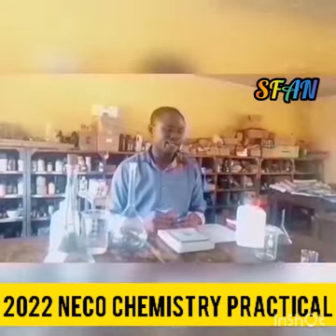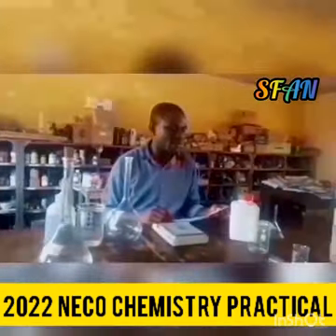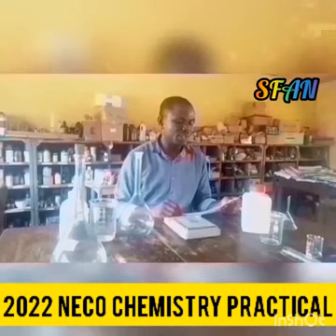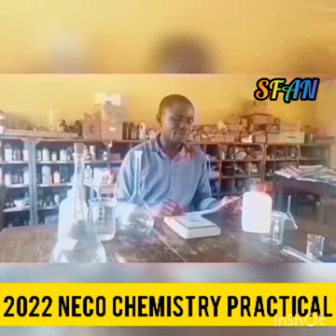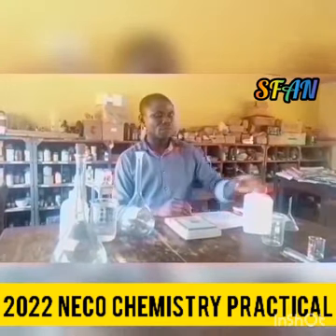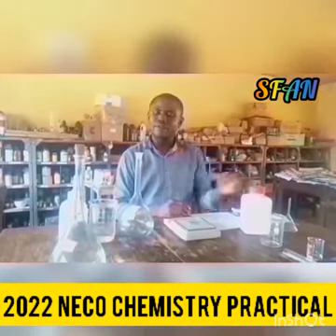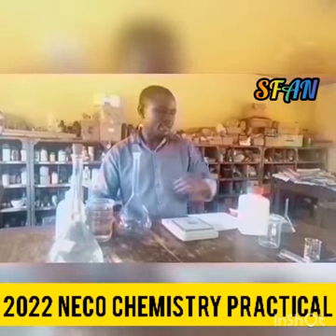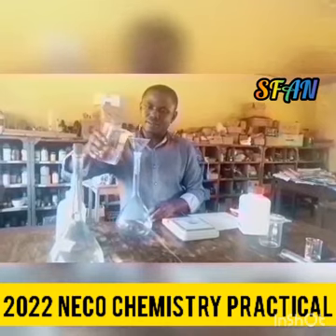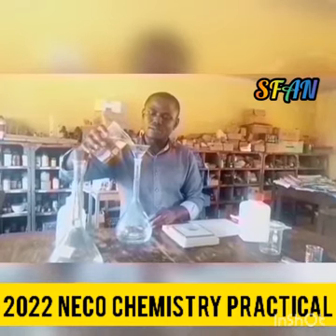I'm going to prepare the sodium trioxocarbonate(IV). According to the instruction, we have 150 cm³ of sodium trioxocarbonate(IV) solution in a bottle labeled BN. The solution, which should be the same for all candidates, will contain 4.20 grams of sodium trioxocarbonate(IV) per dm³ of solution. So I'm going to measure out 4.2 grams of this sodium trioxocarbonate(IV). Firstly, I'm going to transfer a little of my distilled water, maybe about 250 cm³ or thereabout.